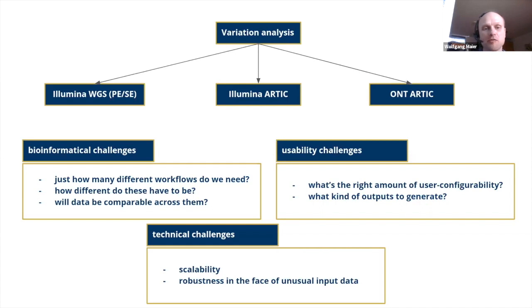And it took us like half a year or so to really eliminate all these potential pitfalls, because you only see them coming up occasionally with this one outlier data set that produces them, right? So when you analyze your data like we do in batches of, say, 2,000 samples at a time, for a long time during the development of these workflows, we always had that one outlier that we never saw before in a new set of, say, 2,000 data sets.